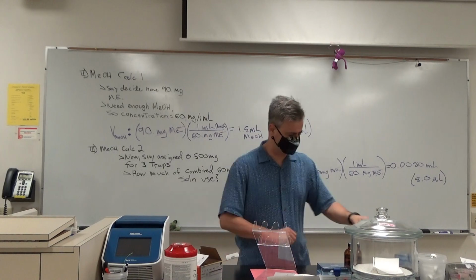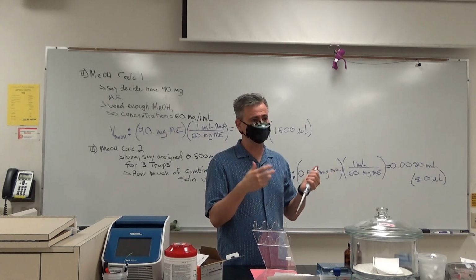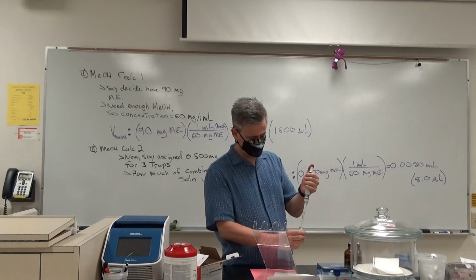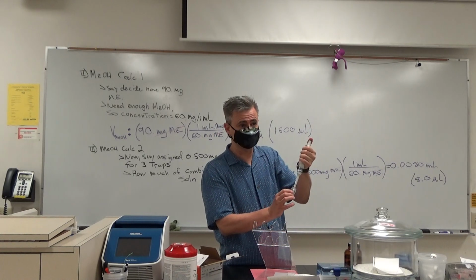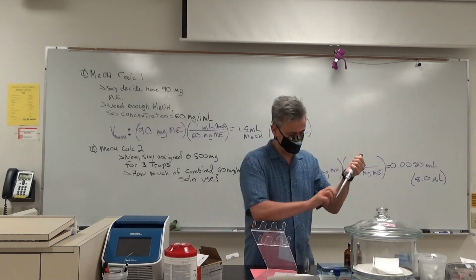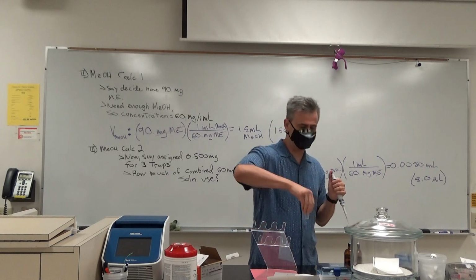Okay, and then to put it actually in, let's say I've got the glycerol in here, and I'm going to deliver, let's say, 50 microliters. So I get my 50 microliters. What you should do is, don't just squirt it in there on top of the glycerol. Stick this down within the glycerol and squirt it sort of underwater, so to speak. Then you can take it out. I would clean off that tip before you make the next trap, and you can swirl this around.